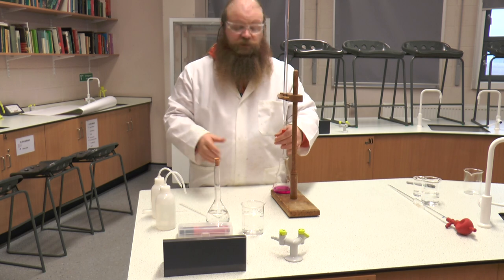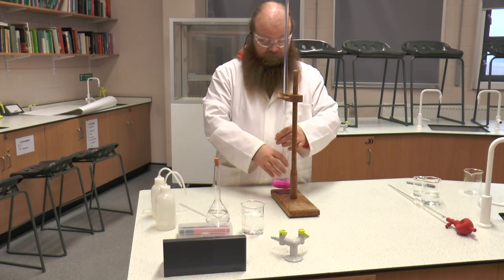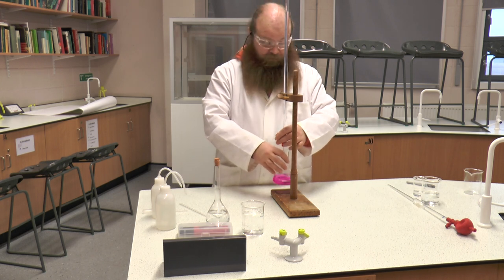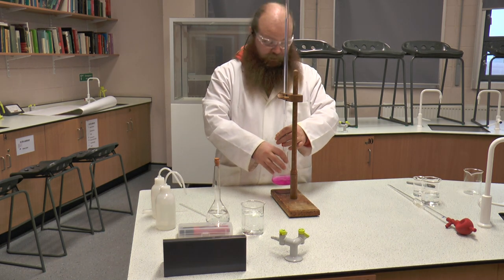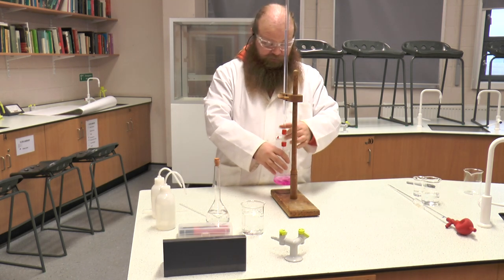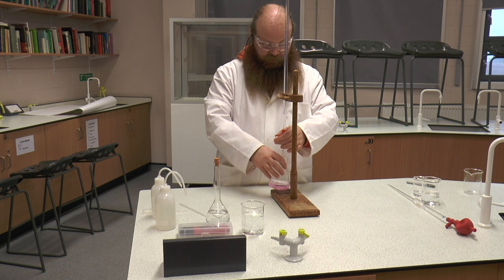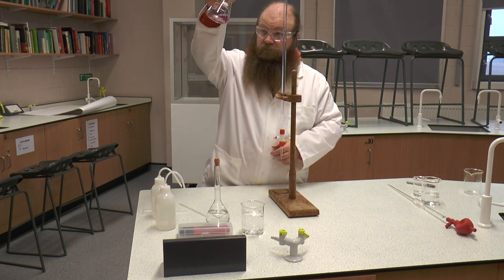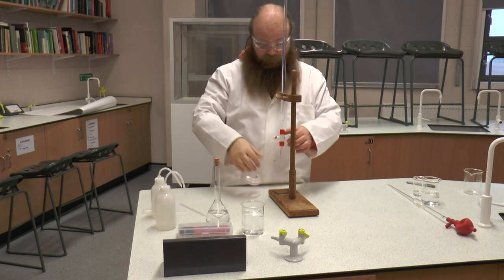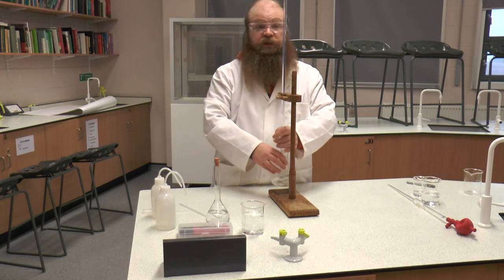Now we know that the end point went at around 21. So this time, knowing we are starting at 0.1 and that it went around 21 last time, we can run it fast — just gently agitating it — until we are around about the 18–19 mark, at which point we slow down. It is around about 19, so I have just stopped. I am now going to set the tap just shy of pink — it is still slightly pink. I am now going to add drop at a time until the solution changes colour.